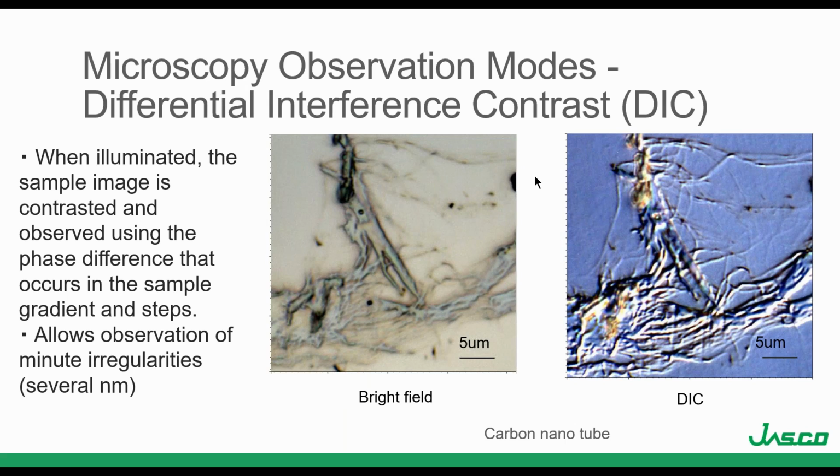The last observation mode that I want to show is the differential interference contrast, or very well known as DIC.